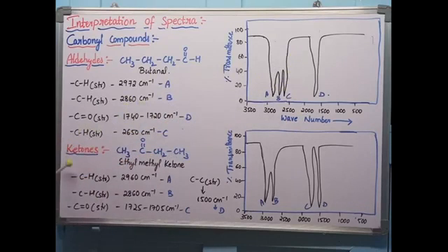Now let us see ketones. I am taking the example of ethyl methyl ketone. The CO is bonded to two alkyl groups, and that is called a ketone. This side CH3, this side CH2, CH3. According to IUPAC, you will get ethyl first, so ethyl methyl ketone.